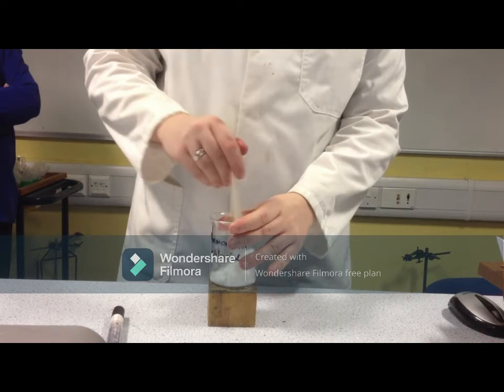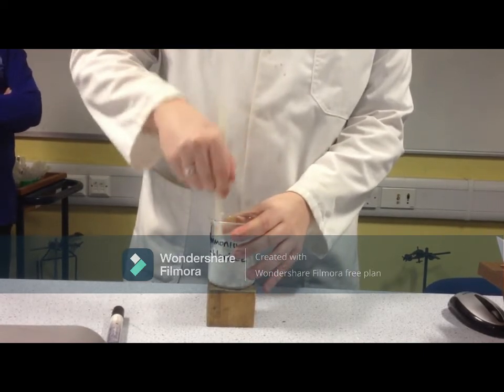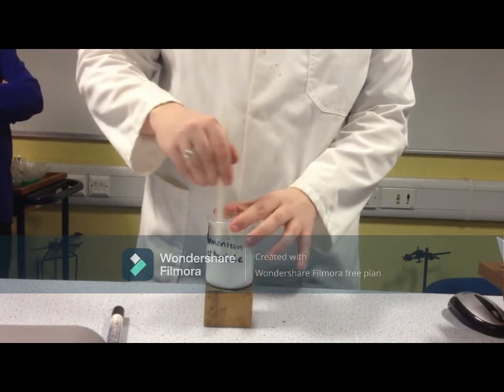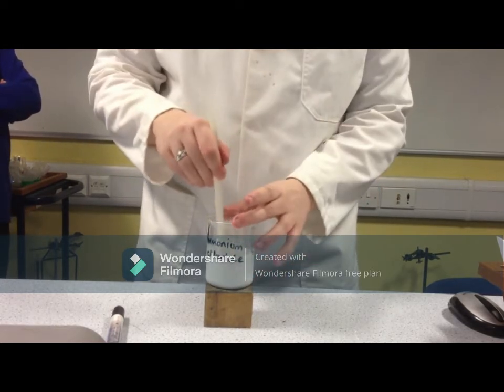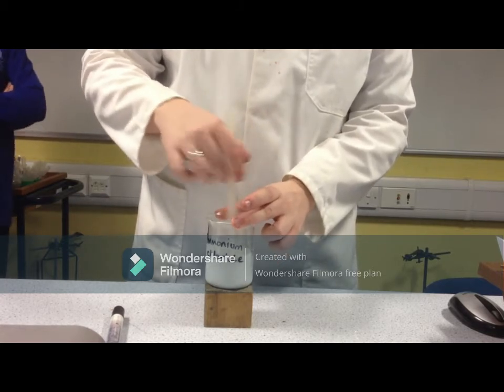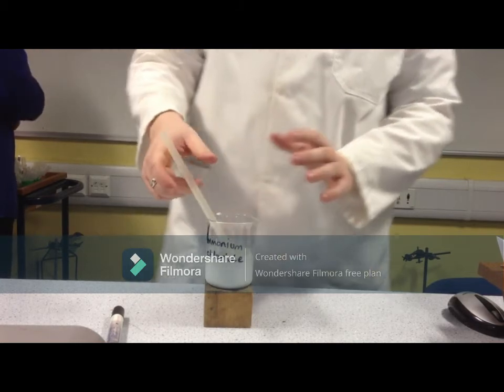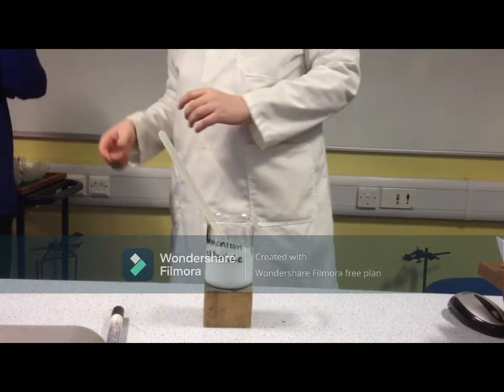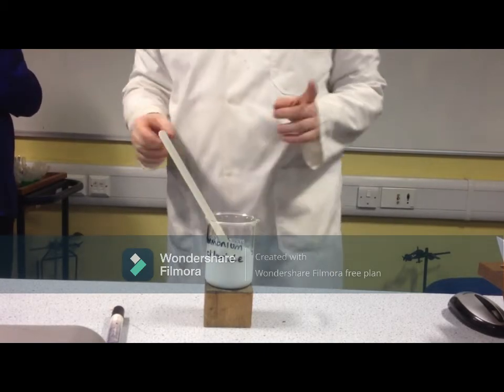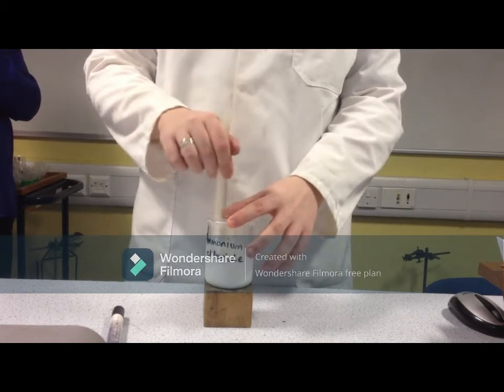Unfortunately, the temperature reading cannot be shown. The temperature will actually drop or decrease because the reaction absorbs heat from the surroundings, causing a decrease in the surrounding temperature. So this experiment cannot be carried out at home because the chemicals are not available in any household material.